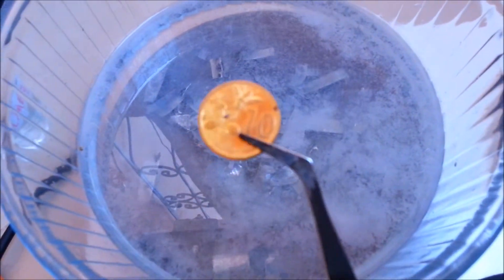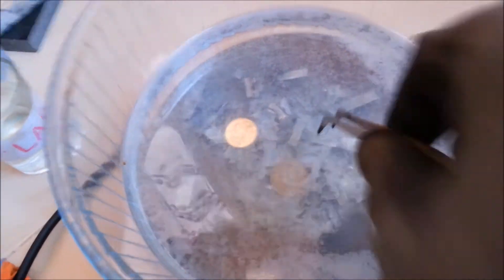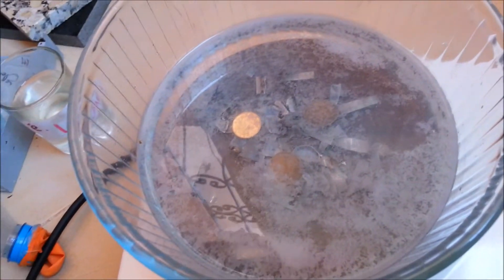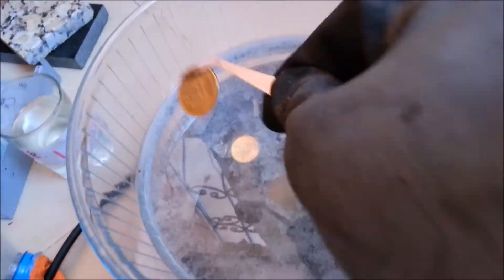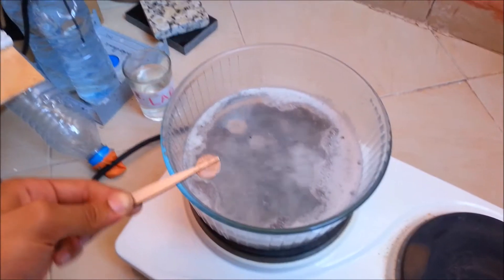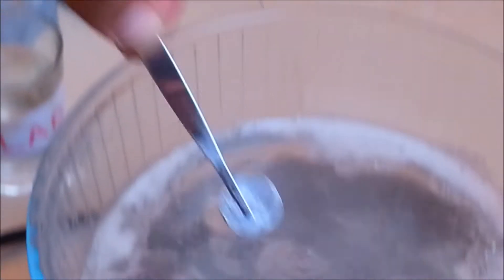Now we have to put our coins into the solution. After 20 minutes from the beginning of the experiment, we can see that the coins became silver-colored — they look like silver.